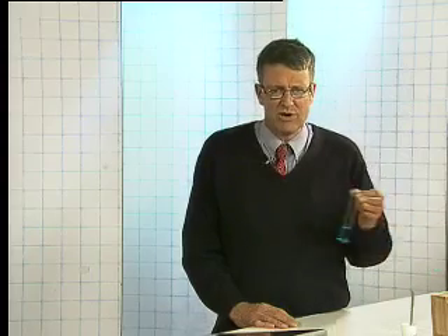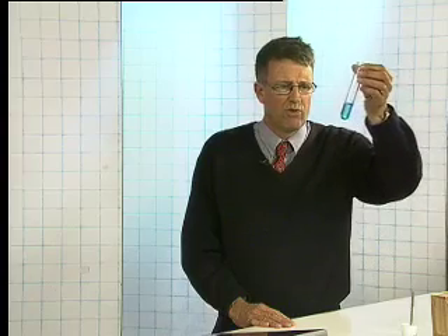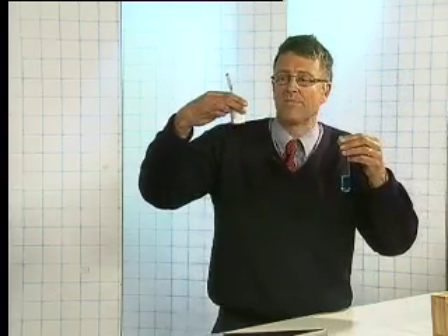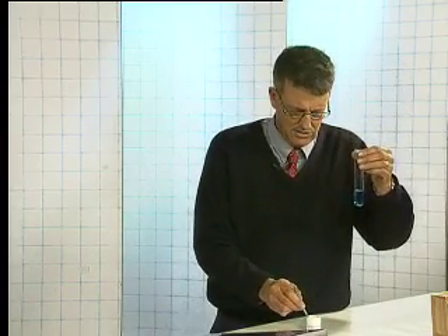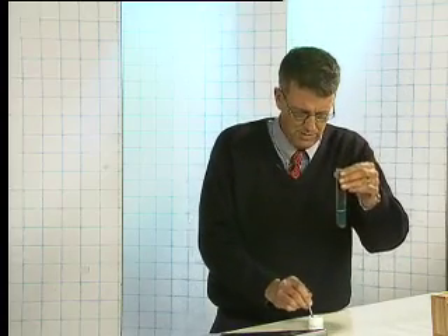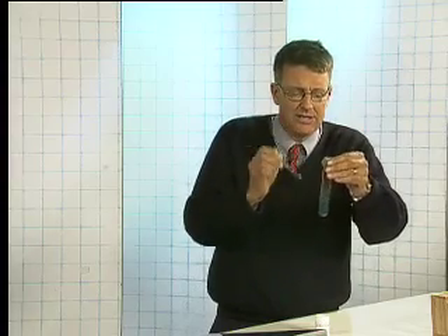We're going to try a simple experiment today. Here on my hand I have some copper sulfate, or cupric sulfate. What we're going to do is take some iron powder and add two spatulas full of it into this test tube.